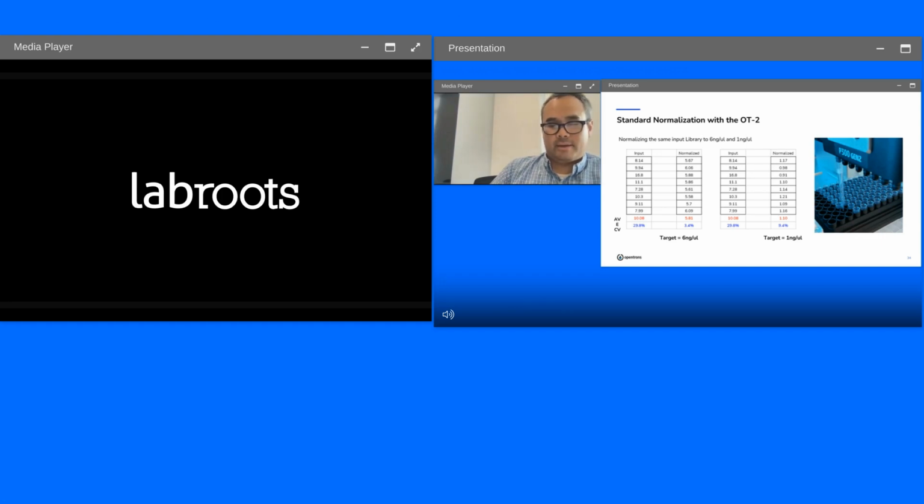And the column in the middle, that's diluting it down to 1 nanogram per microliter. So if I were to do this normally, I would set up my robots, I would do all the library prep, I would get my quantifications, I would stop, I would clean out the deck, I would switch out the multi-channels and put single channels in there so that I could do normalization. But I had a little workaround in which using the very flexible Python scripting, I'm able to pick up just a single tip using a multi-channel and use that to pipette into each well individually.